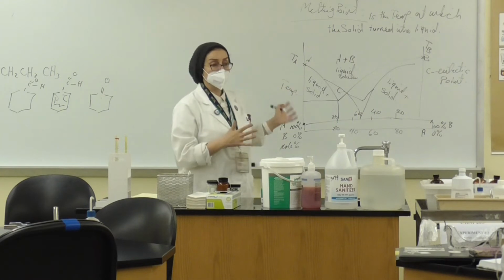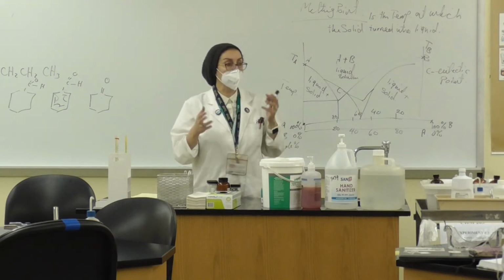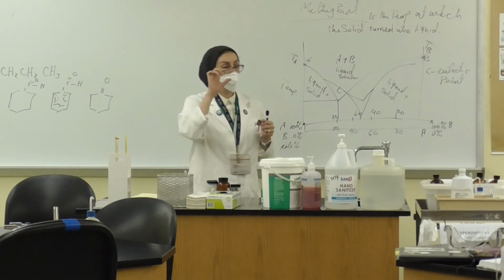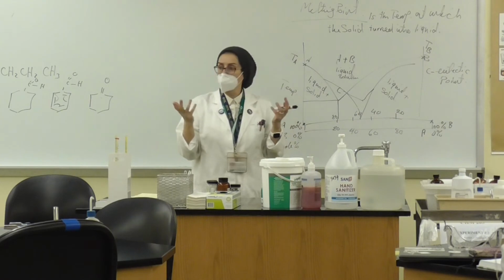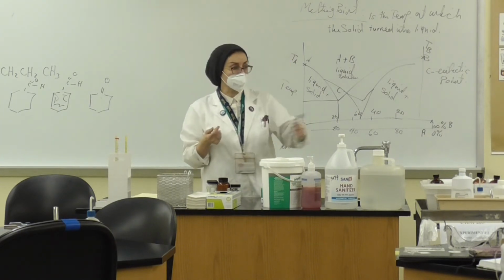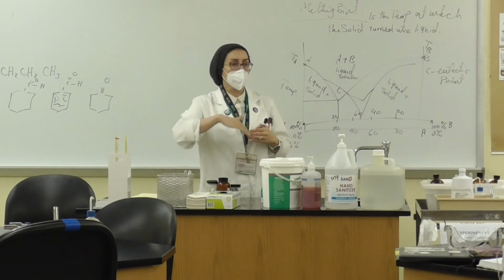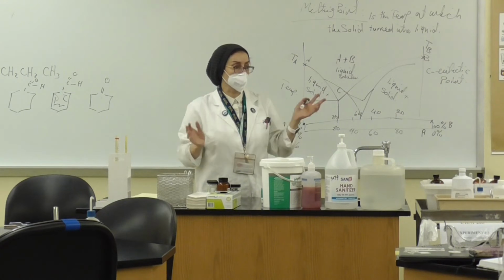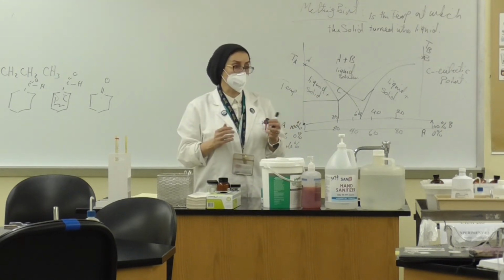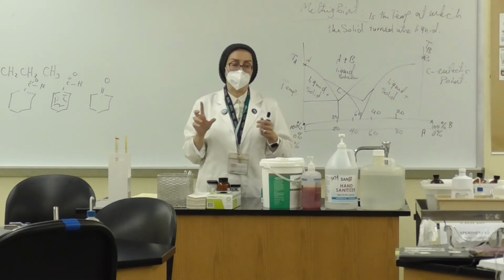Now, with melting point, probably sometimes we're going to face some problems. For instance, if we have a very low melting point, sometimes the melting goes beyond, in other words lower than what we expected, and then it is going to vanish altogether. It is going to disappear. Maybe it is going to evaporate if it is a short and small chemical.